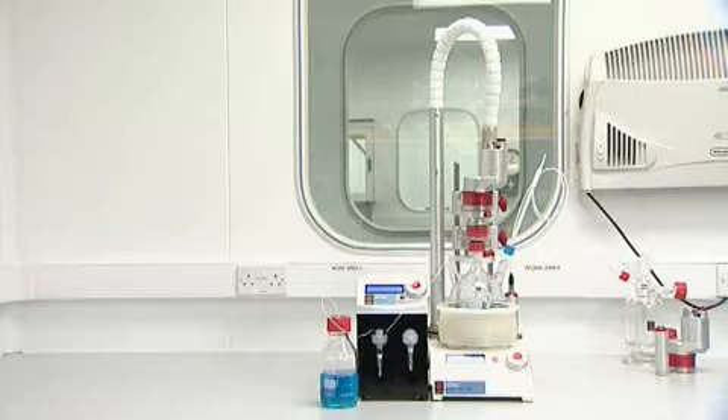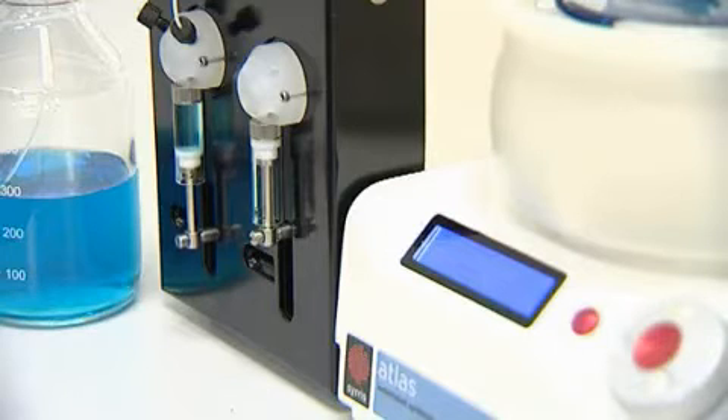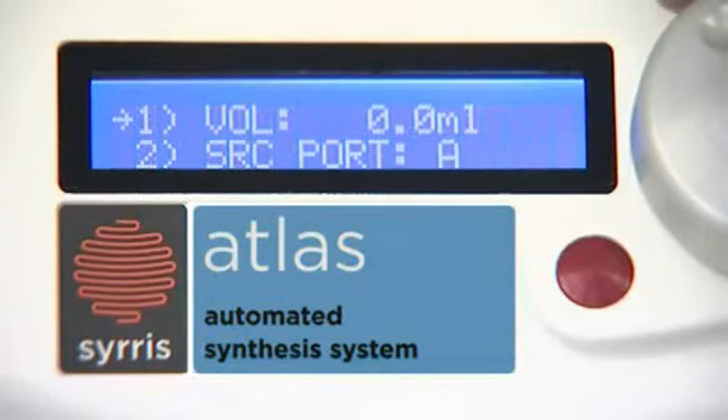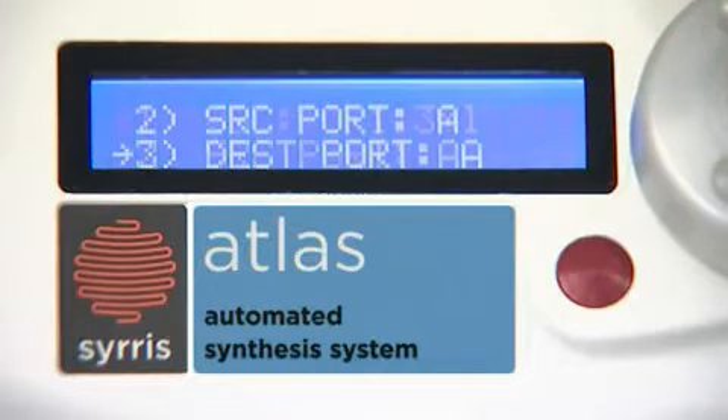The Atlas syringe pump offers automatic reagent dosing for simple additions, or intelligent active control of parameters including pH and temperature. Controlled by the Atlas base or used by itself, the versatile syringe pump can be configured into two independent refilling flows, one continuous flow, or an auto-sampler.